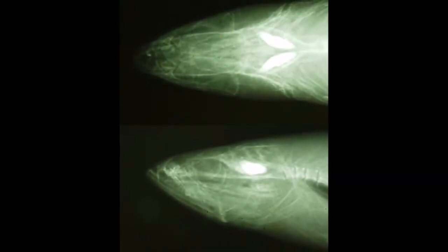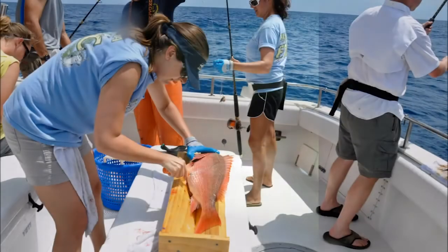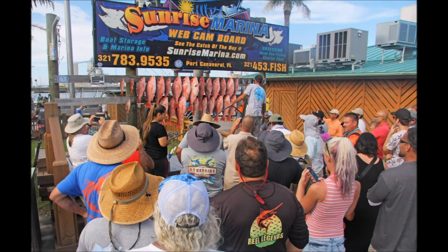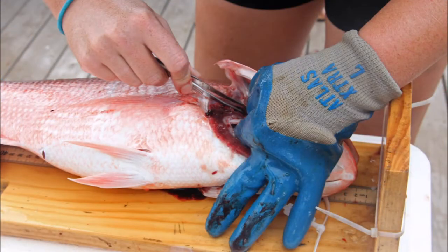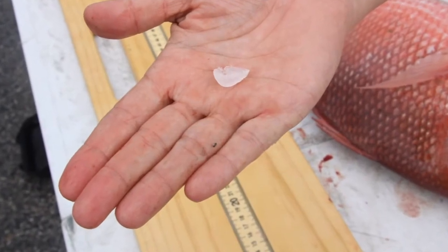Unfortunately, removing the otolith is lethal because it's contained within the head of the fish just behind the brain. Thankfully, approximately 70% of the otoliths that we use for age and growth analyses come from the fishery — that is to say the fish was captured either by a commercial or recreational angler and we were able to sample the fish and remove the otolith before it went to market or to the dinner table.